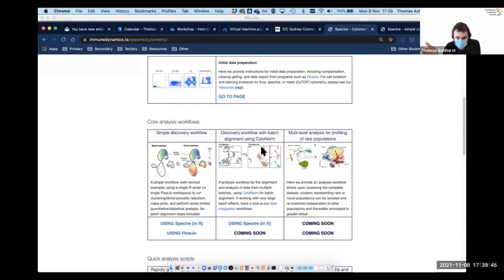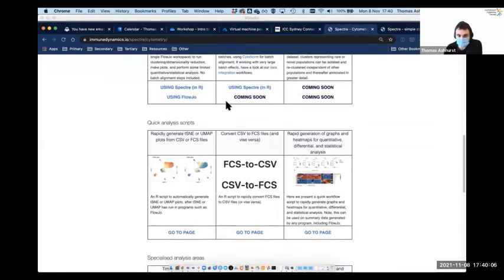If you stain two sets of samples on two different days, you may have slight differences in staining levels. So how do you know what's a biological effect versus what's a technical effect? Using some of these tools, we can make that assessment and correct the data so that we remove technical batch effects, leaving only the biological differences, which is what that workflow will tackle specifically.